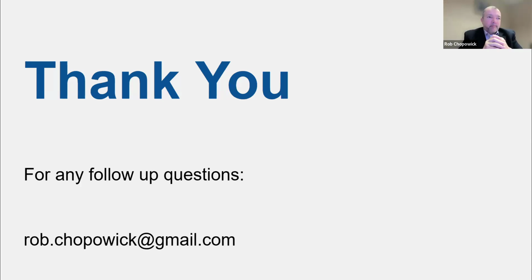Ductless fume hoods. No, that's a growing thing in the industry. And I can speak being Canadian. I'm also the chair for the Canadian Standards Association standard, the Z316.5. And we've addressed that, it's been a growing thing. We're addressing that in our standard. And I believe other standards in the US are starting to address that more. It's not going away, but it's important that anybody who's writing about it and trying to implement it into a standard understands the limitations. And I think if you talk to all the manufacturers of ductless fume hoods, they'll be the first to say, "Hey, we have limitations here. Don't just treat this as a normal fume hood."